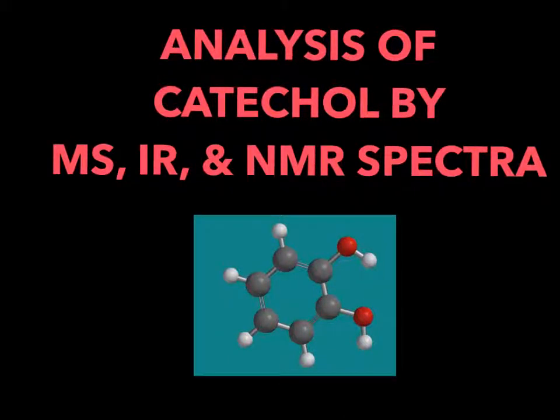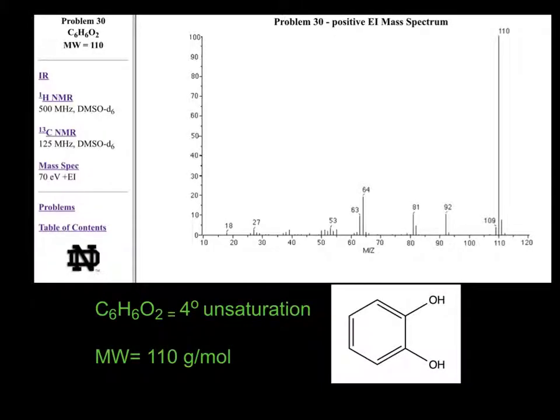In this video, we will take a known molecular formula, a known molecular weight, and construct an adequate molecular structure based on MS, IR, proton NMR, and carbon-13 NMR spectra.